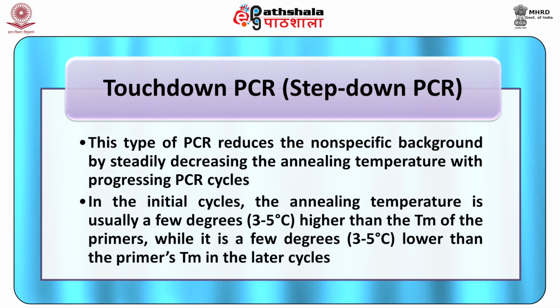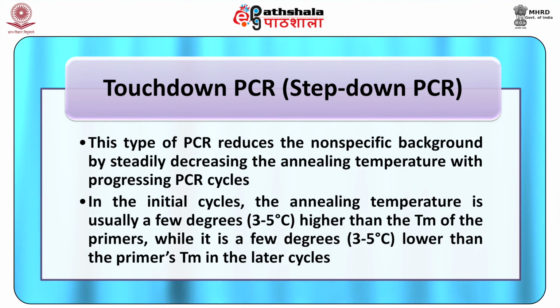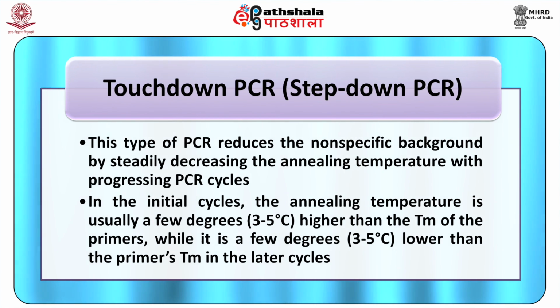Touchdown PCR, also referred to as step down PCR. This type of PCR reduces the non-specific background by steadily decreasing the annealing temperature with progressing PCR cycles.